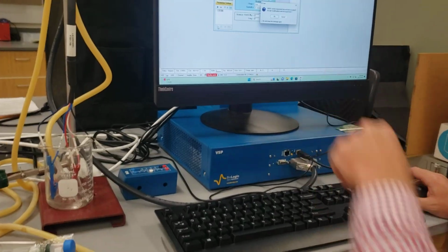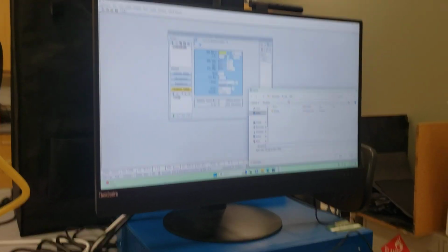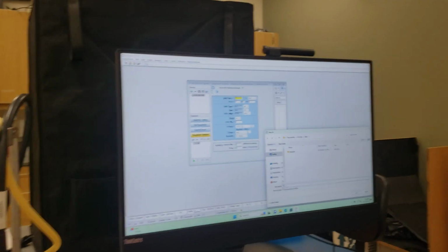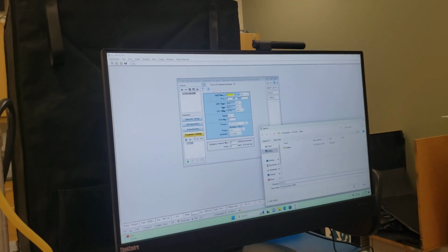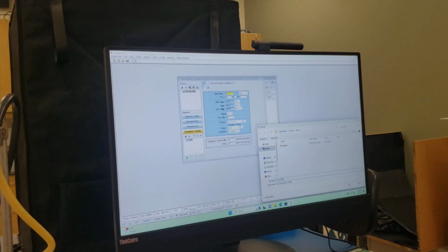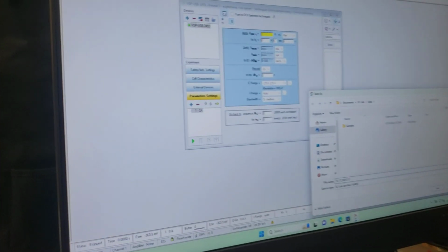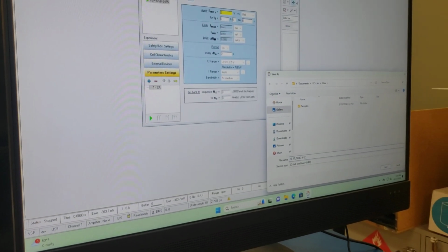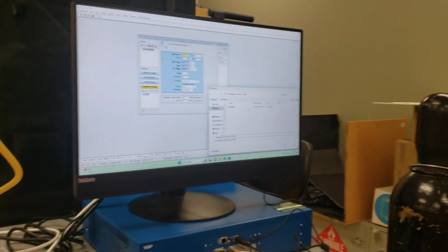And then I go back here and I can push start, say okay, and then I'm going to save it somewhere. I always start with the date of the experiment, 2024. And then I can call this 2 volts, 0.1 molar, I can't use the point, underscore molar, potassium nitrate.